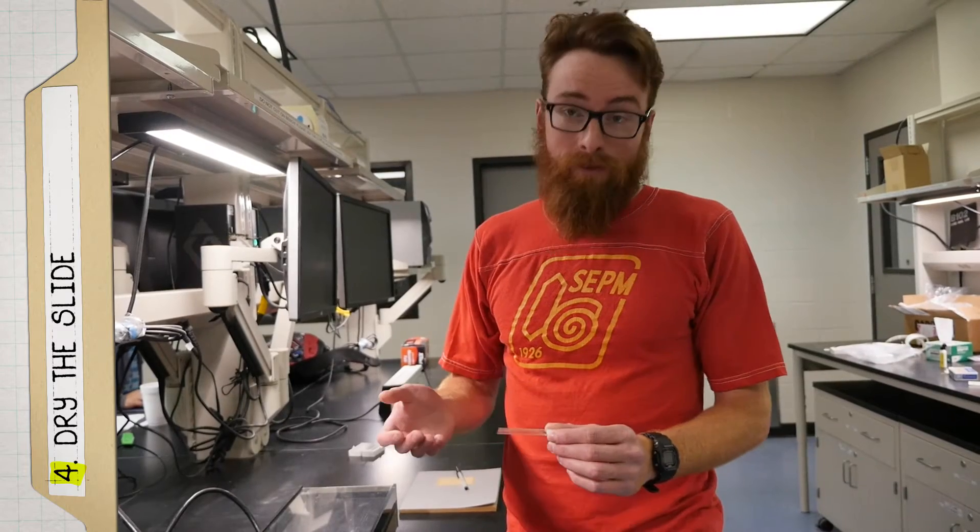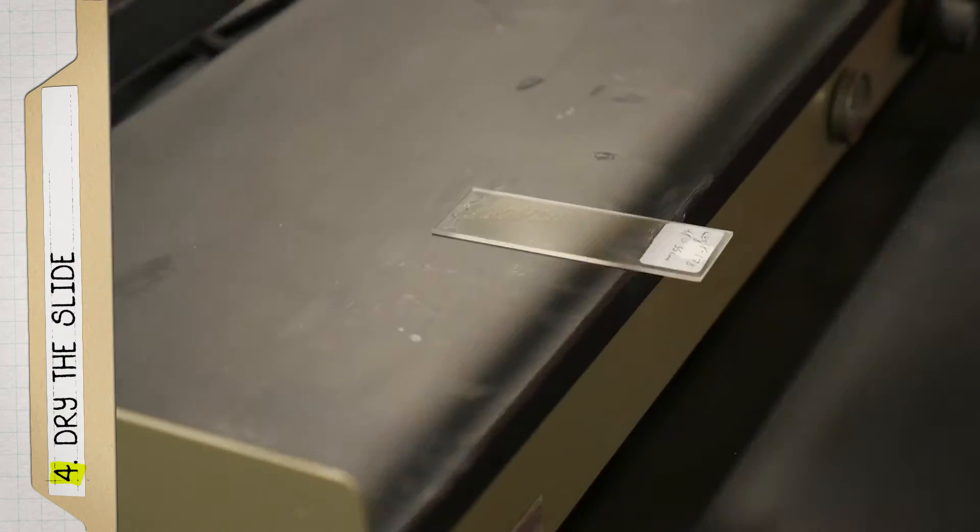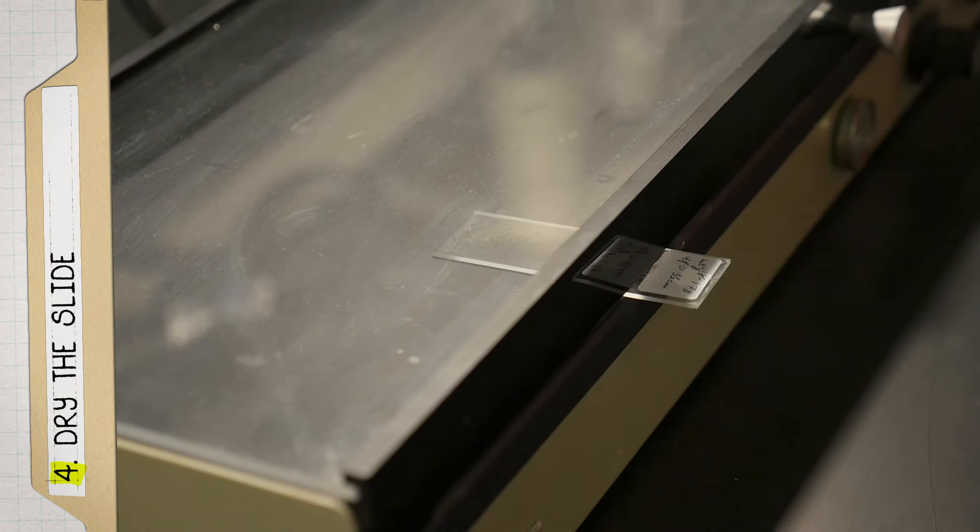After we've dispersed the sample on the slide, we have to dry off the water. So we use a hot plate, place the slide on the hot plate, close it, and come back when it's dry.